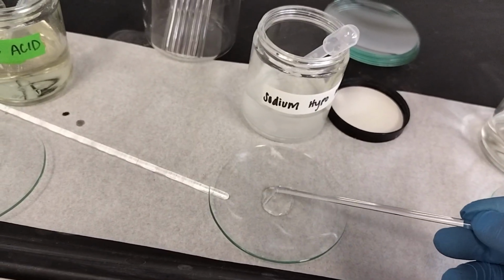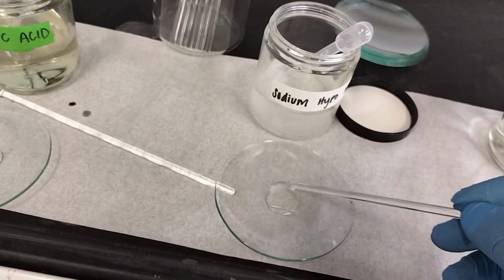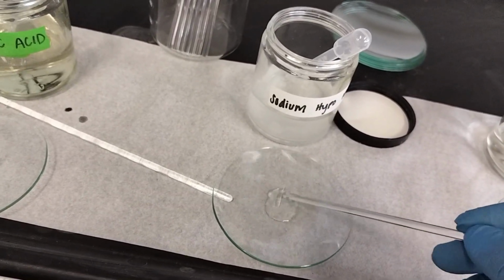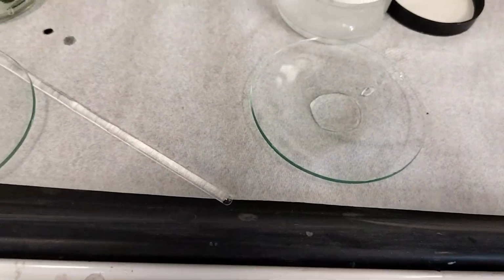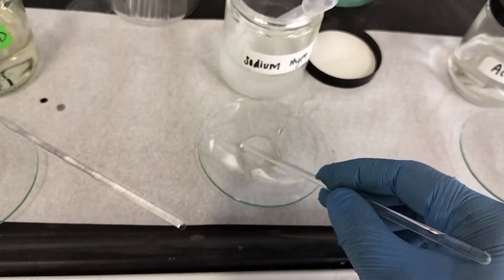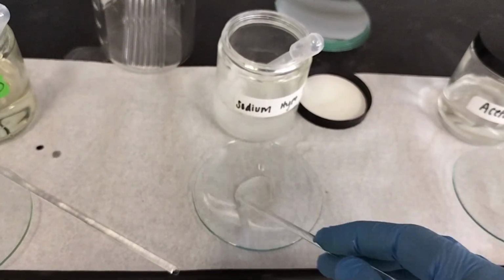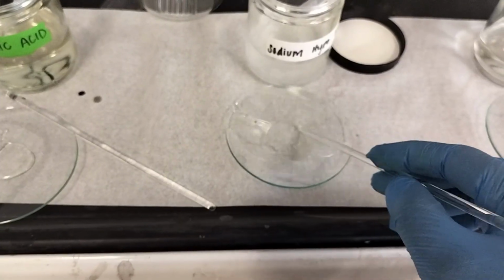Now I will gently stir the fiber in the sodium hypochlorite and wait a minute for the results. After about 3 minutes, the fiber has completely dissolved. So this confirms that the sample is wool fiber.